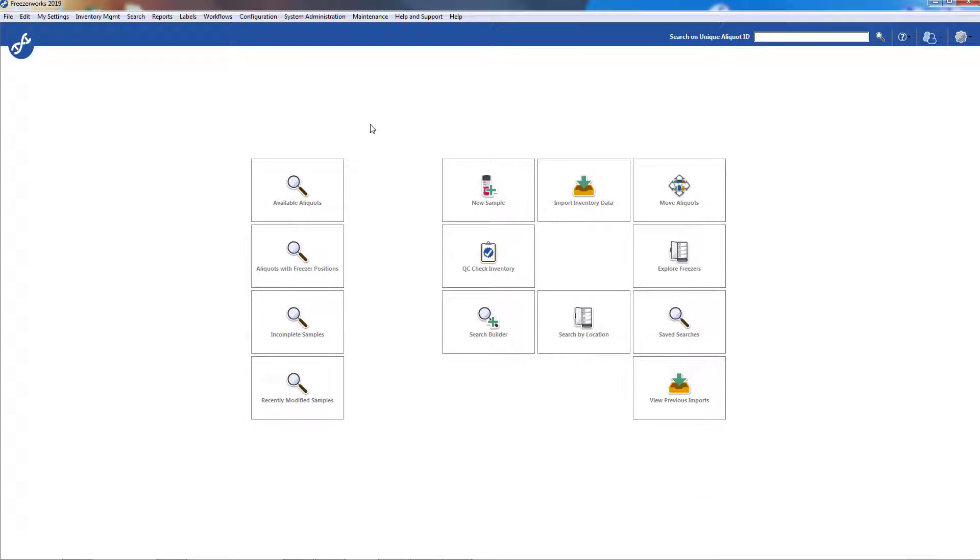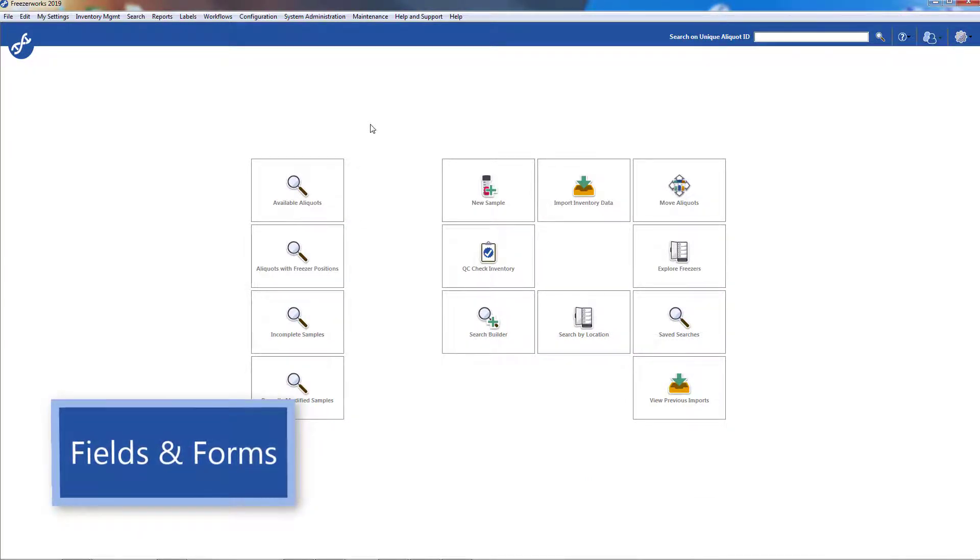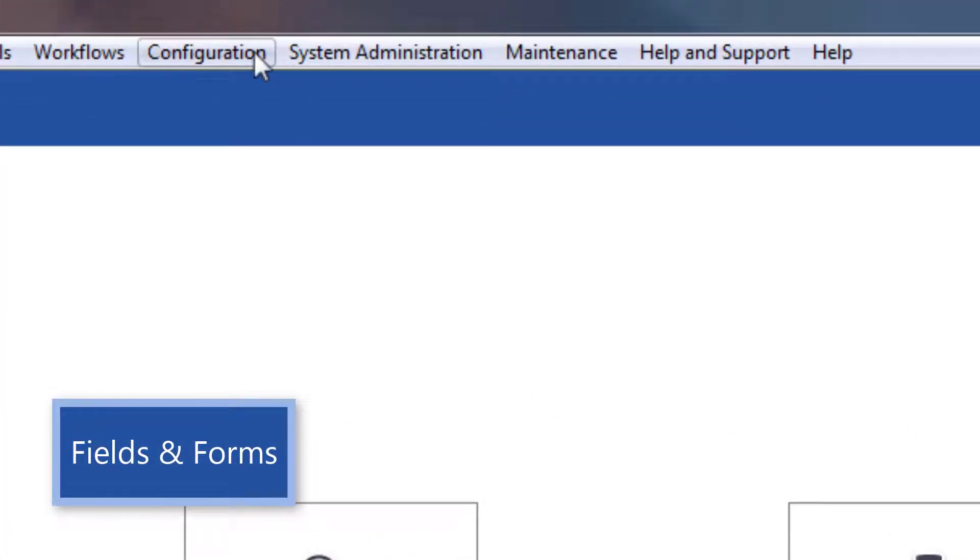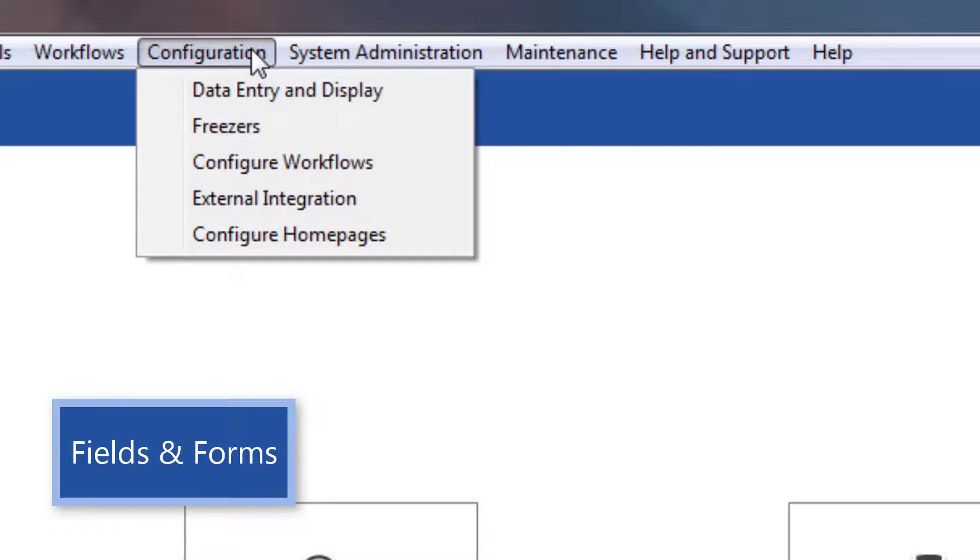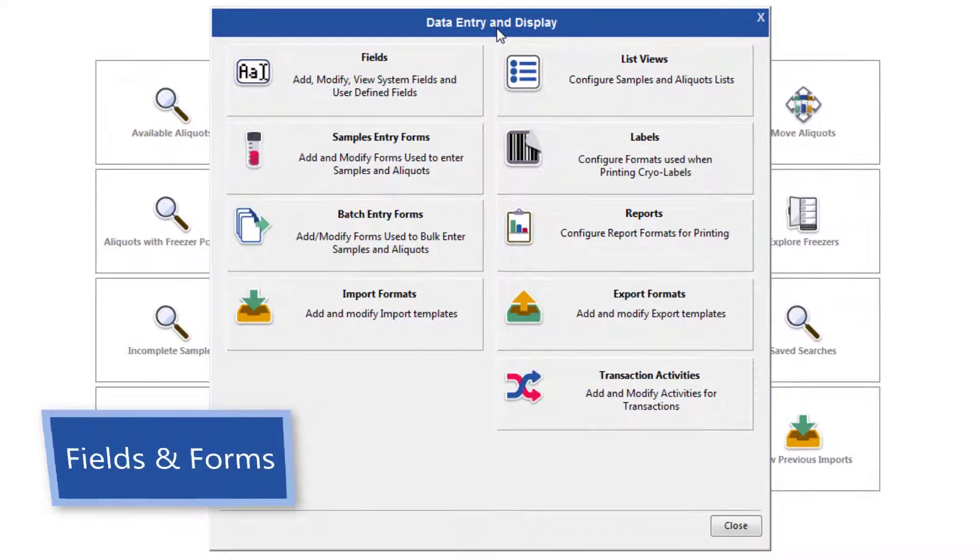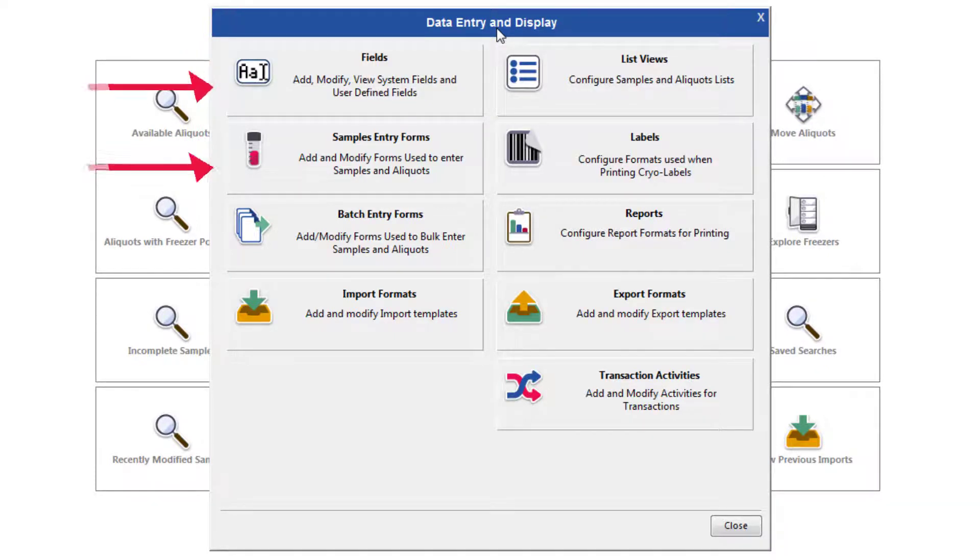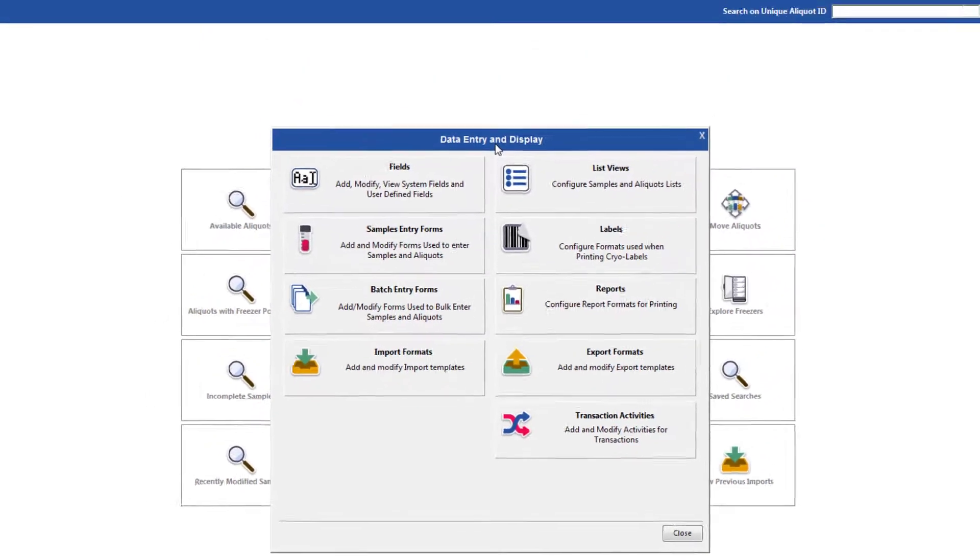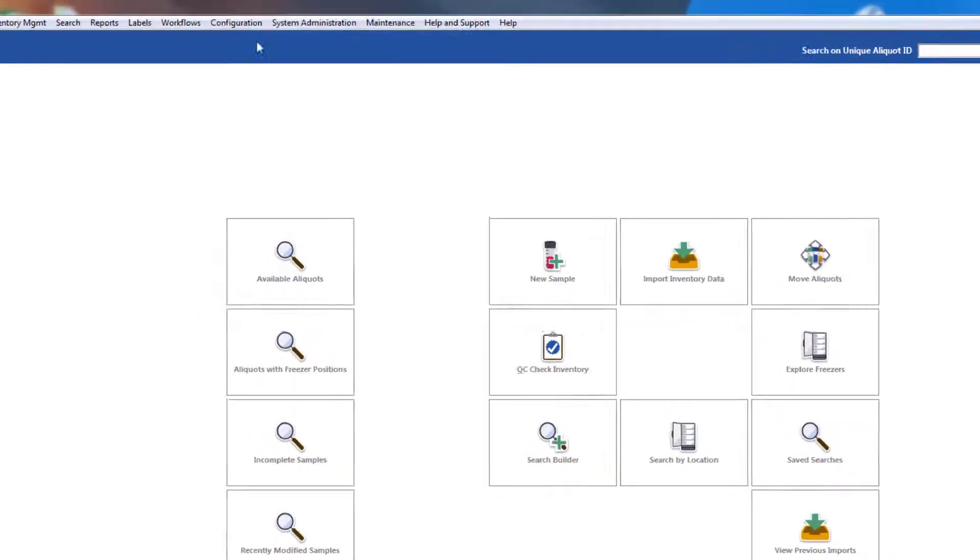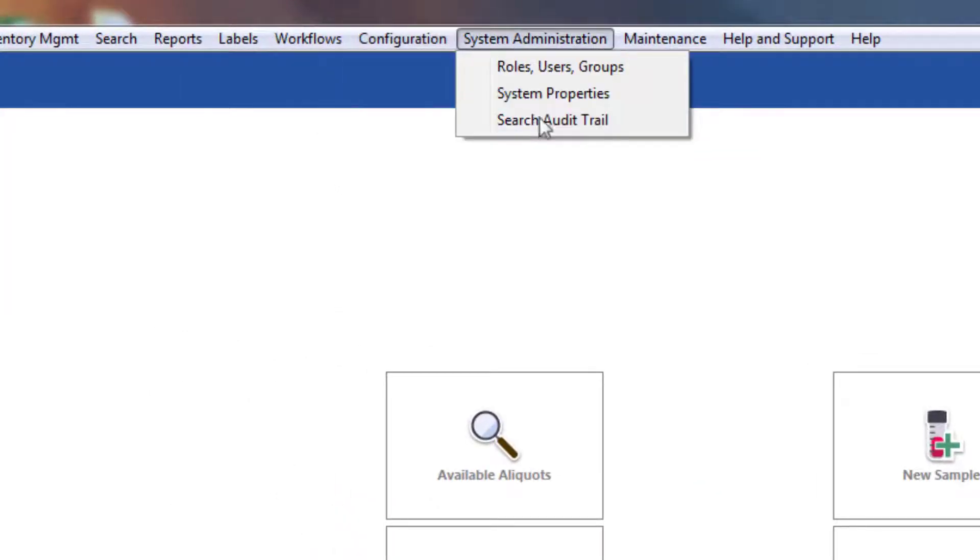Finally, to configure fields and forms, open the configuration menu and select Data Entry and Display. The fields and forms are here, but we've packed each configuration option with templates that you can start learning with and working from. This includes items not found on this mini-menu, like workflows and groups.